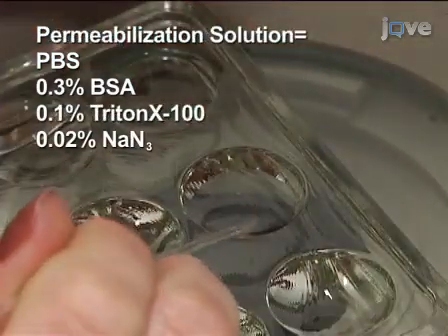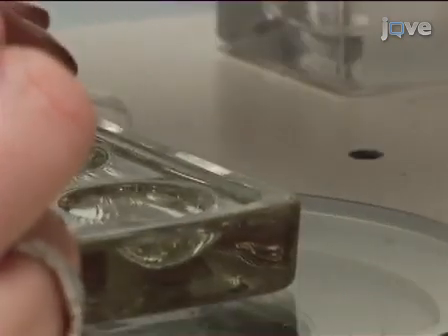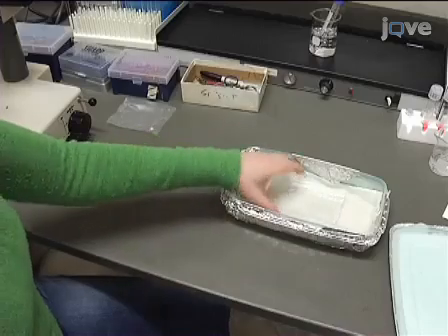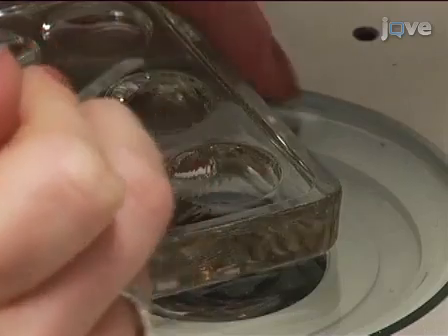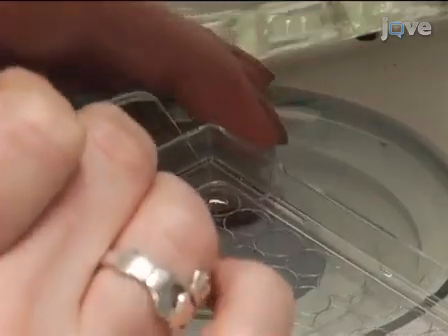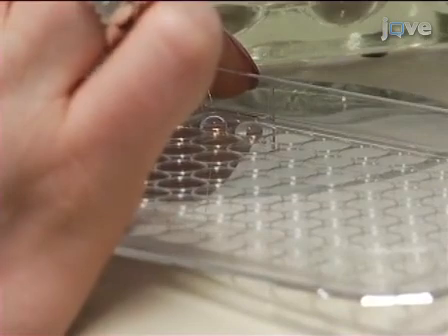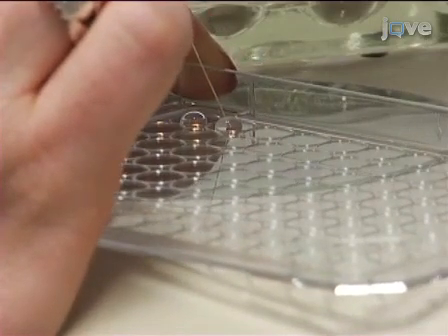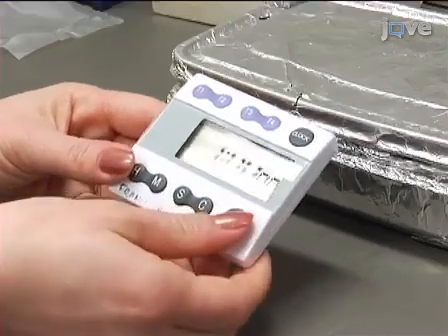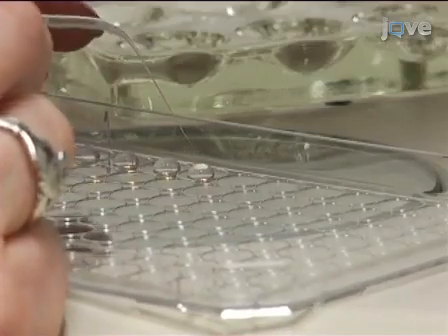Permeabilize eggs for 15 minutes at room temperature, then rinse through several large volumes of blocking solution. Perform the rest of the procedure on the lid of a 96-well plate that is protected from light in a humidified chamber at room temperature. Transfer eggs to 25 microliter drops of blocking solution for 15 minutes. Then, to label centromeres, transfer eggs to a drop of blocking solution containing Crest antiserum at a 1:40 dilution. Incubate for at least 1 hour, then wash through 3 drops of blocking solution, incubating 15 minutes in each.